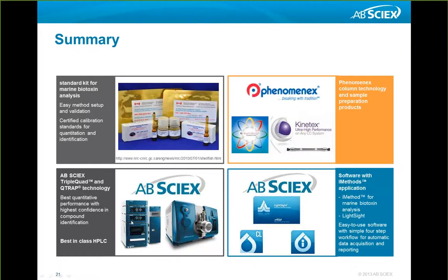We have utilized our LC-MS equipment, the Ultra LC, the QTRAP 4500, 5500 system that we have, by the way, also established in the European Reference Laboratory at the Anagago site there in Vigo in Spain. A tremendous input that we have is from the NRC delivering certified reference material.